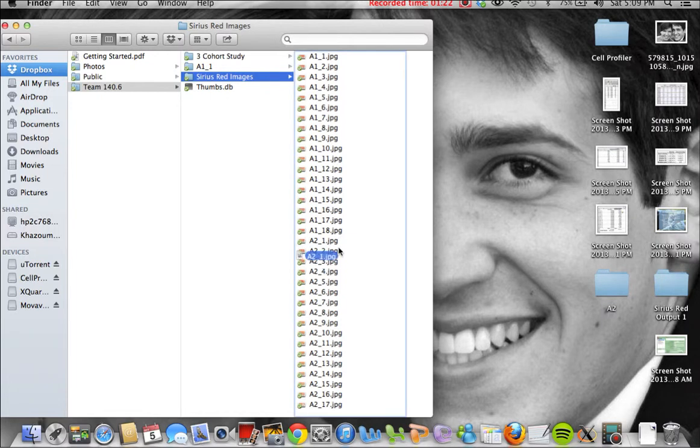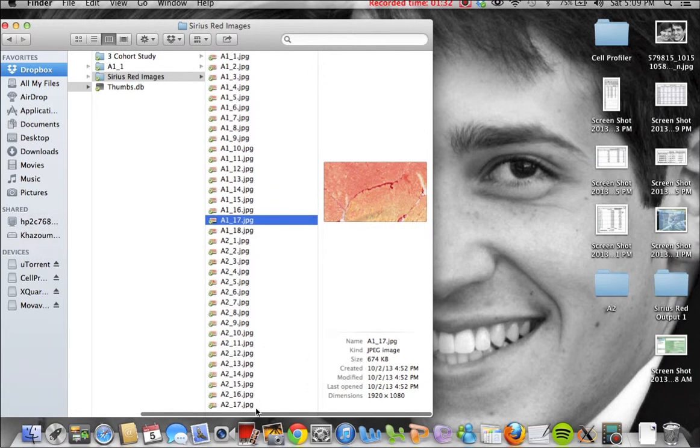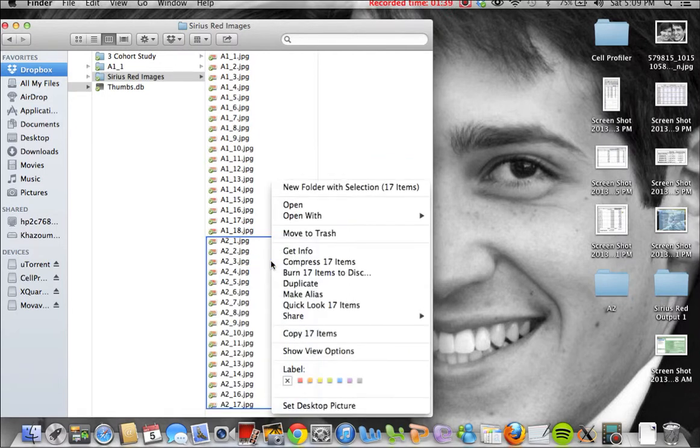But basically, if we want to do A2, then we want to take everything that starts with A2. So let's take all of these, and then we can leave these in here.